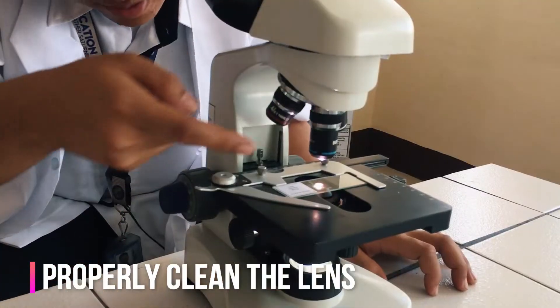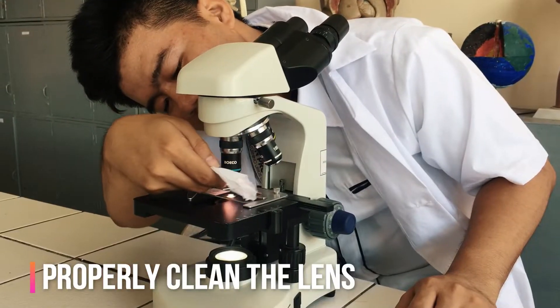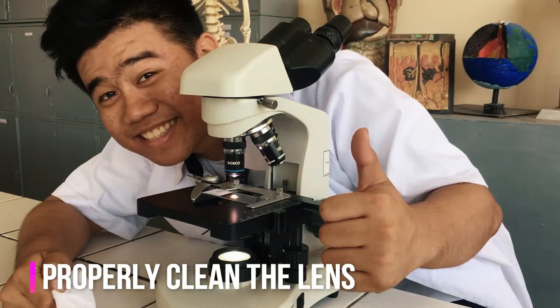Always remember: do not touch the glass part of the lenses with your fingers. Use only special lens paper to clean the lenses.